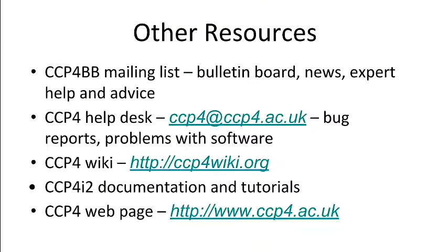And more information, as always, is available on the CCP4 Bulletin Board mailing list, which is the best place to ask any scientific or technical questions related to crystallography, whereas the CCP4 help desk is the best place to report any problems you might have in running CCP4 software or installing it or running the updates or whatever.